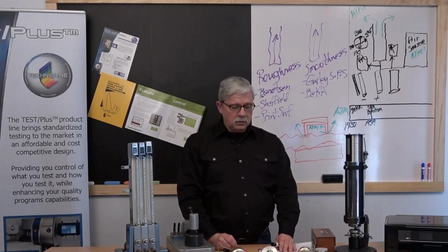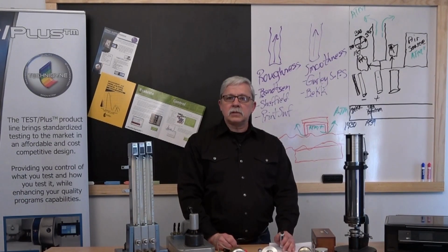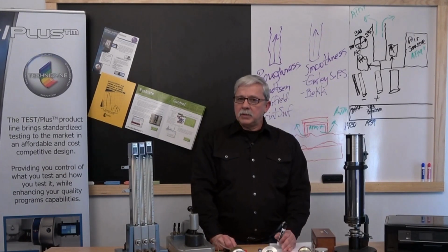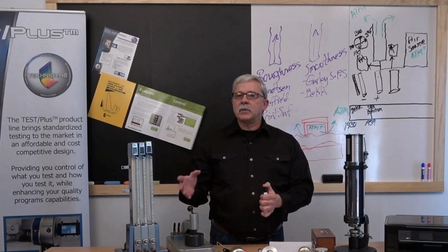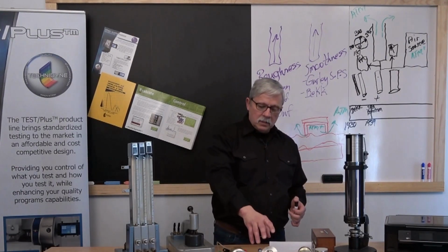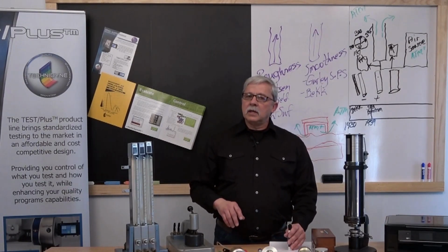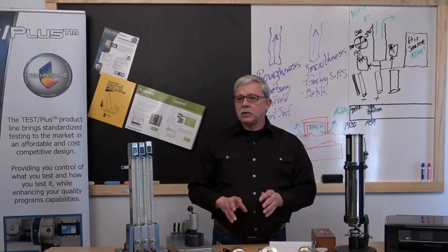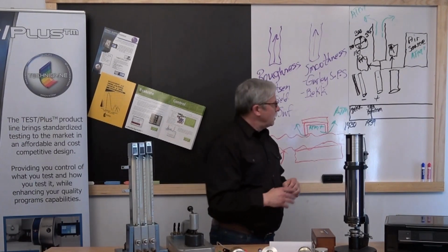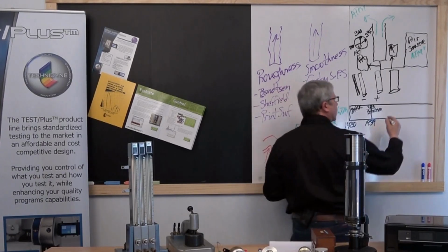Europe was, again, the European was used, sorry, Tom. The Bekk test, of course, was a European design, so that certainly had a bigger influence in Europe and Asia than certainly here in the U.S. There are some companies today still using the Bendtsen test in a variety of different ways, again, probably more so for the purpose of exporting outside the USA.